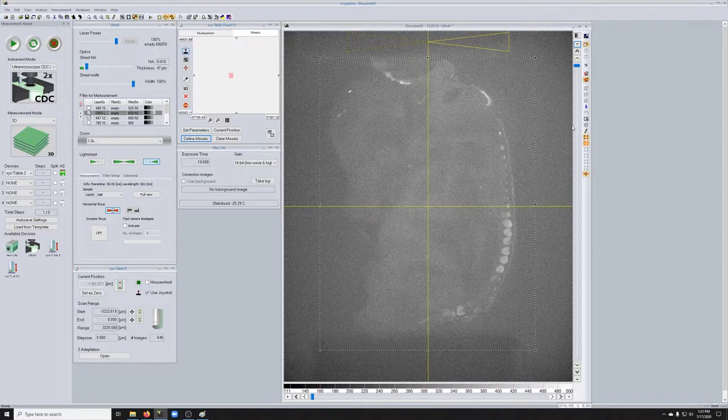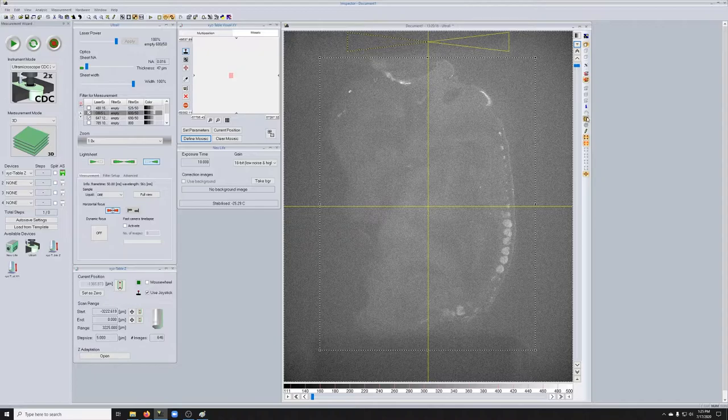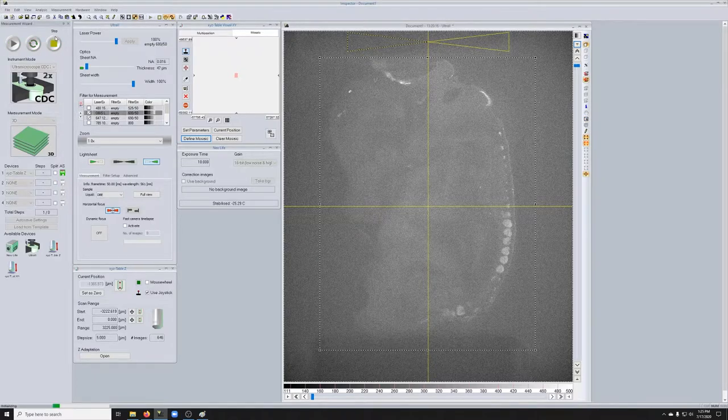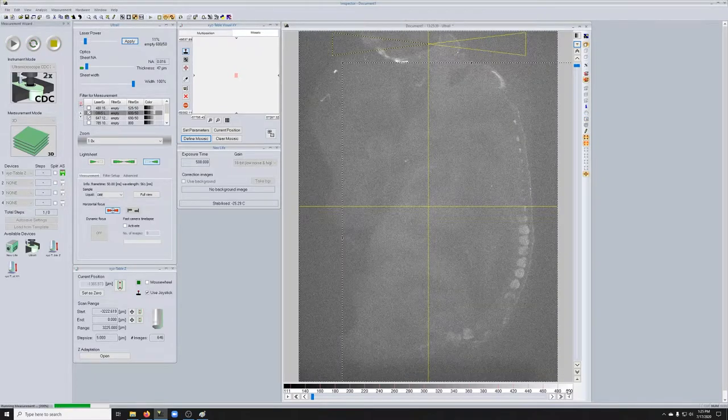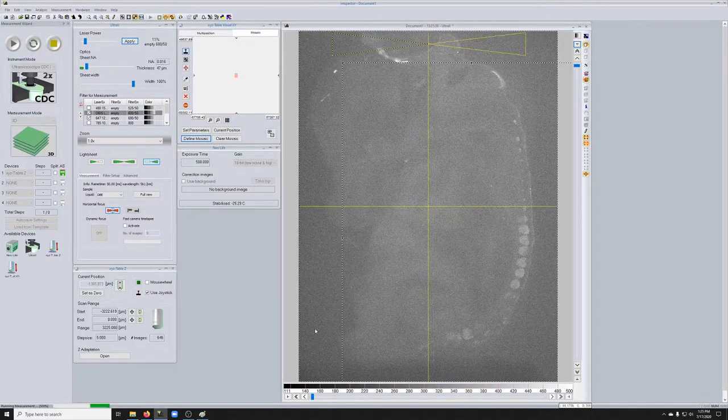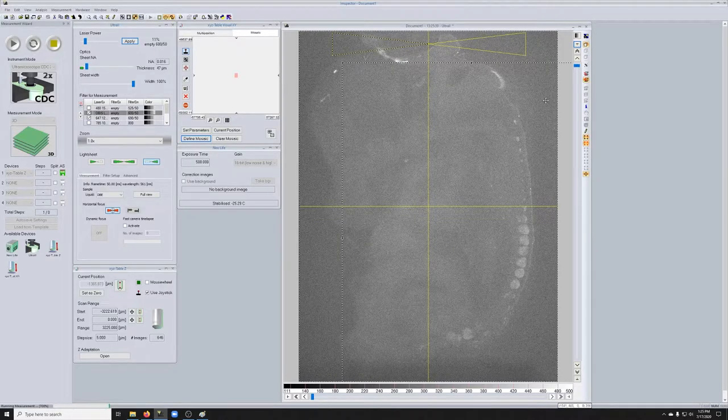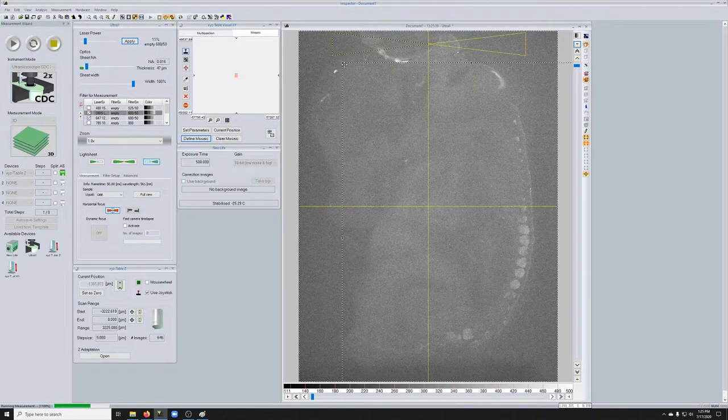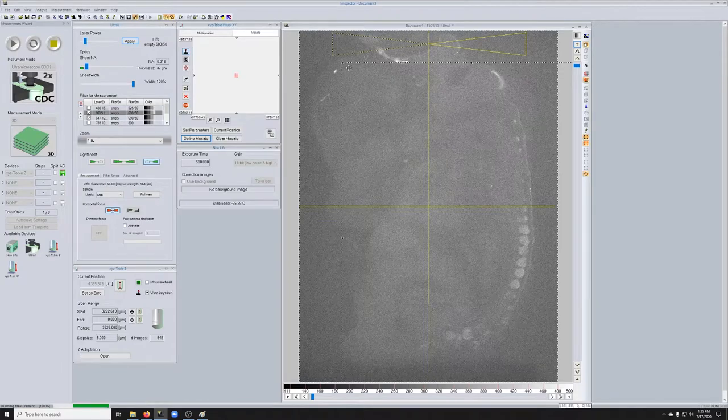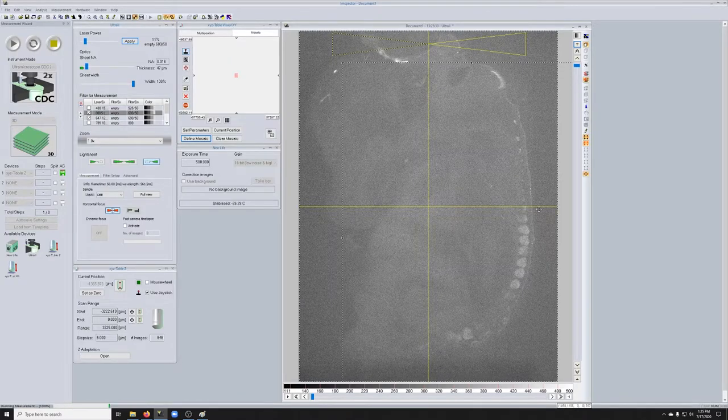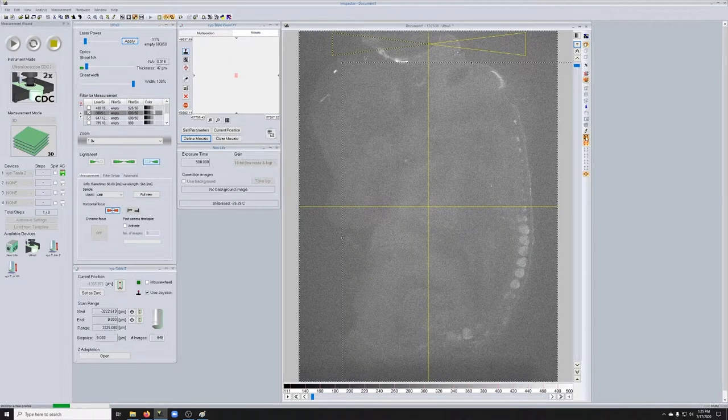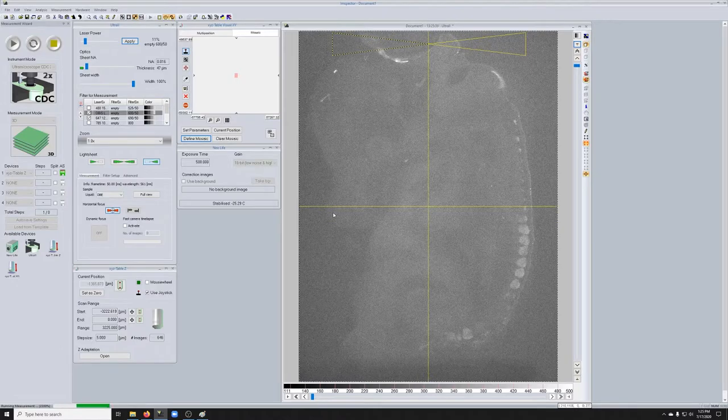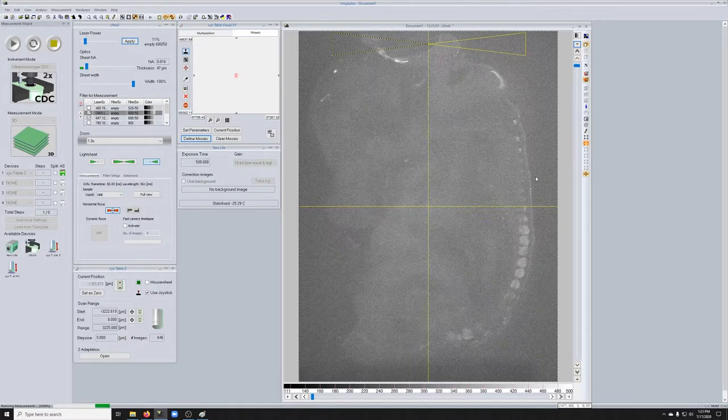So to crop it, what I'm going to do now is click here. I'm not on live, but when I go to live, okay, there we go. So now the image that it's showing me is only in the cropped region, and it has this confusing sort of part of the ROI. You can ignore that, just click on it to turn it off. But now the image is just this.